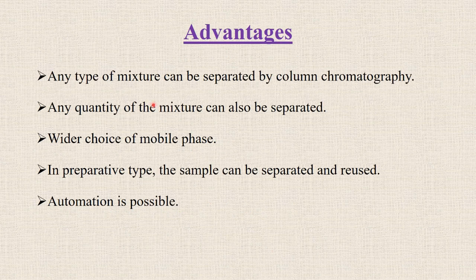Advantages: any type of mixture can be separated through column chromatography. Any quantity of the mixture can be separated. There is a wider choice of mobile phases, and in the preparative type, the sample can be separated and reused, and in some processes, automation is possible.